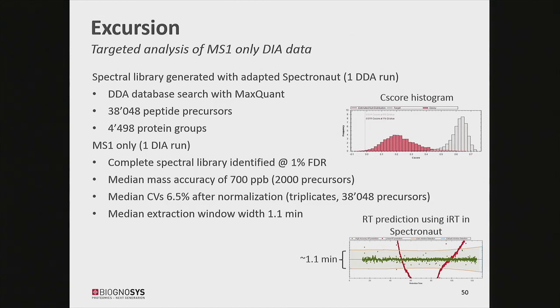Here you can see the high retention time accuracy depicted, so it corresponded to a window of roughly 1 minute in a 120 minutes gradient. This was the accuracy we got in terms of retention time. So it was very encouraging.